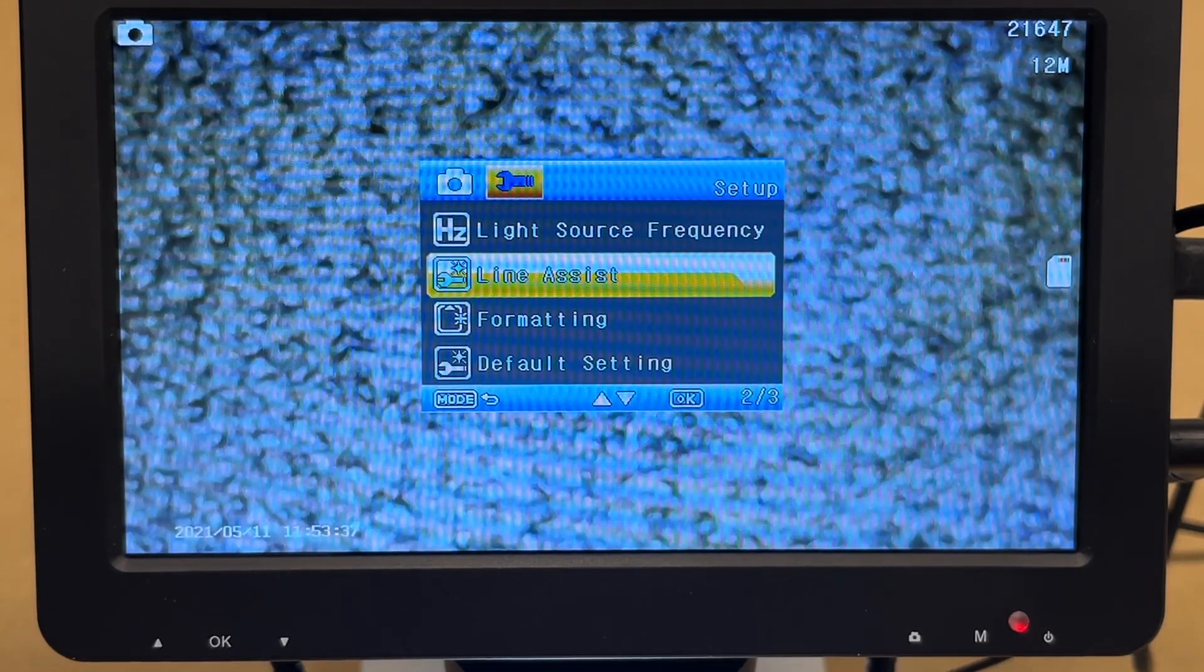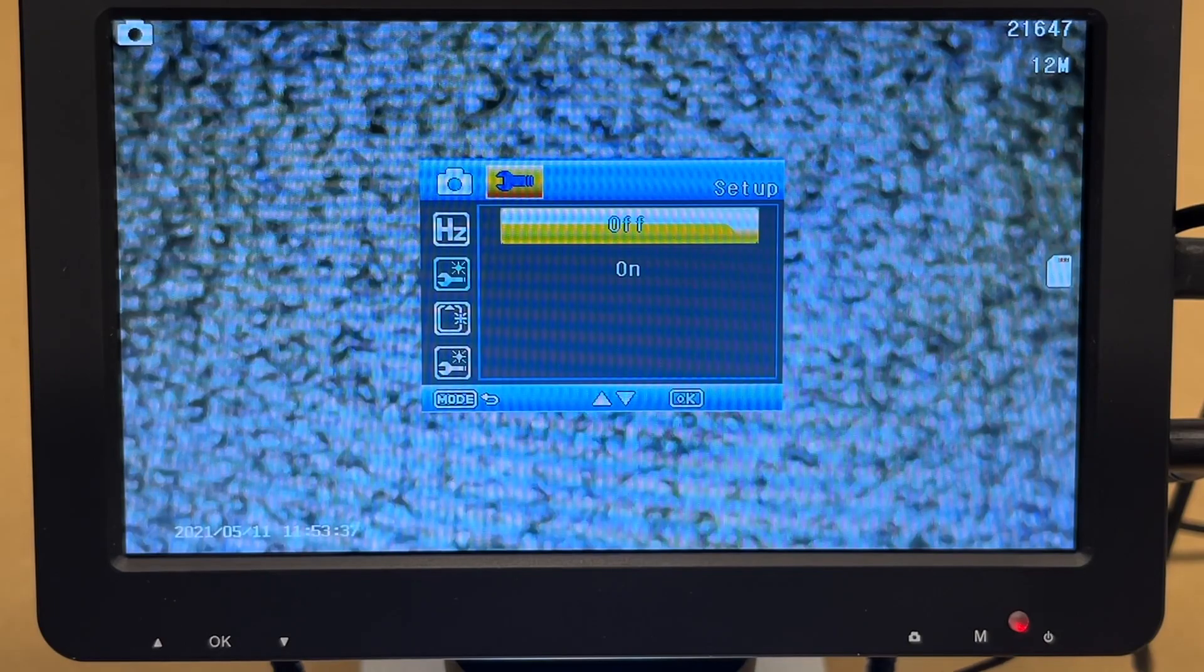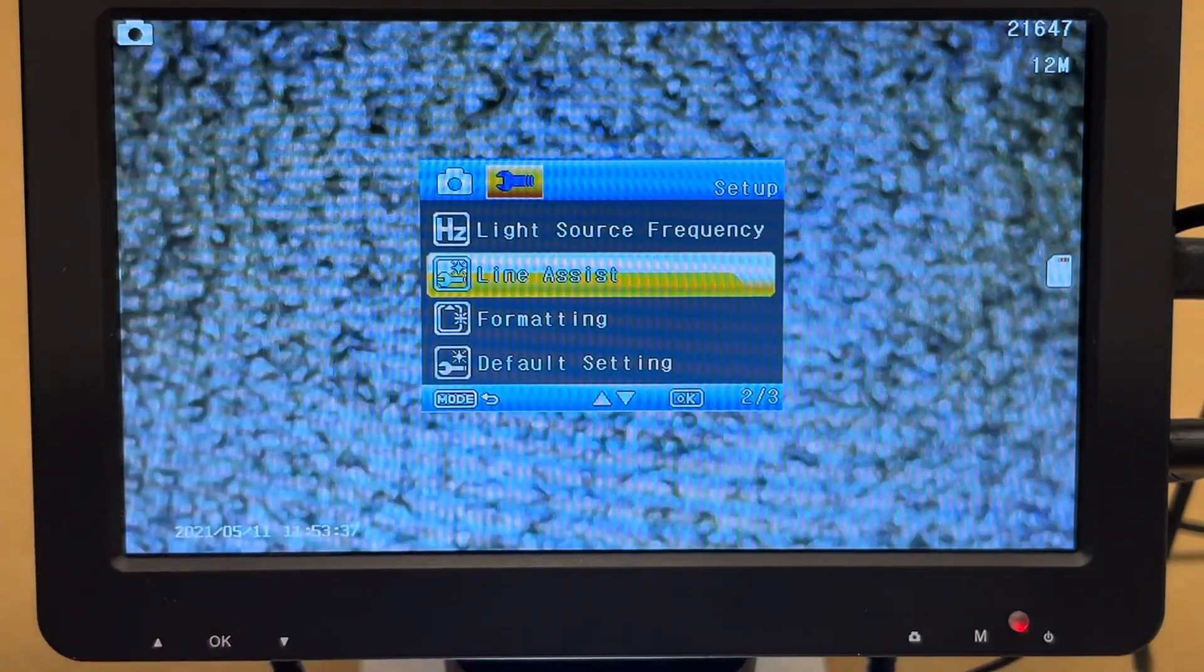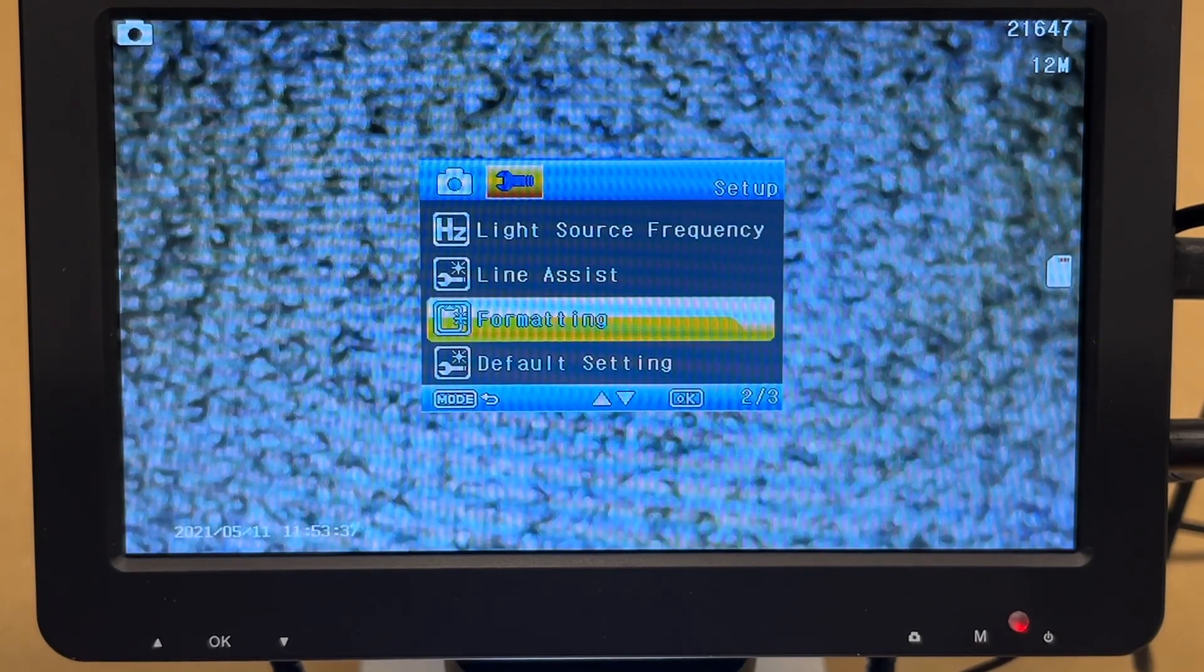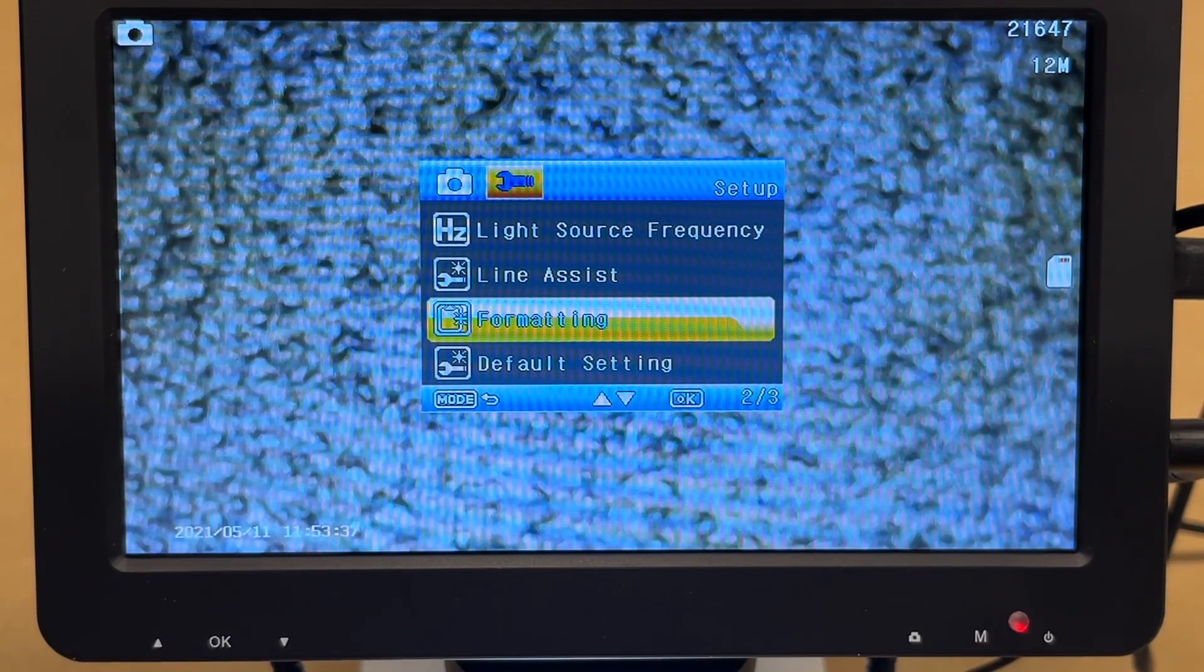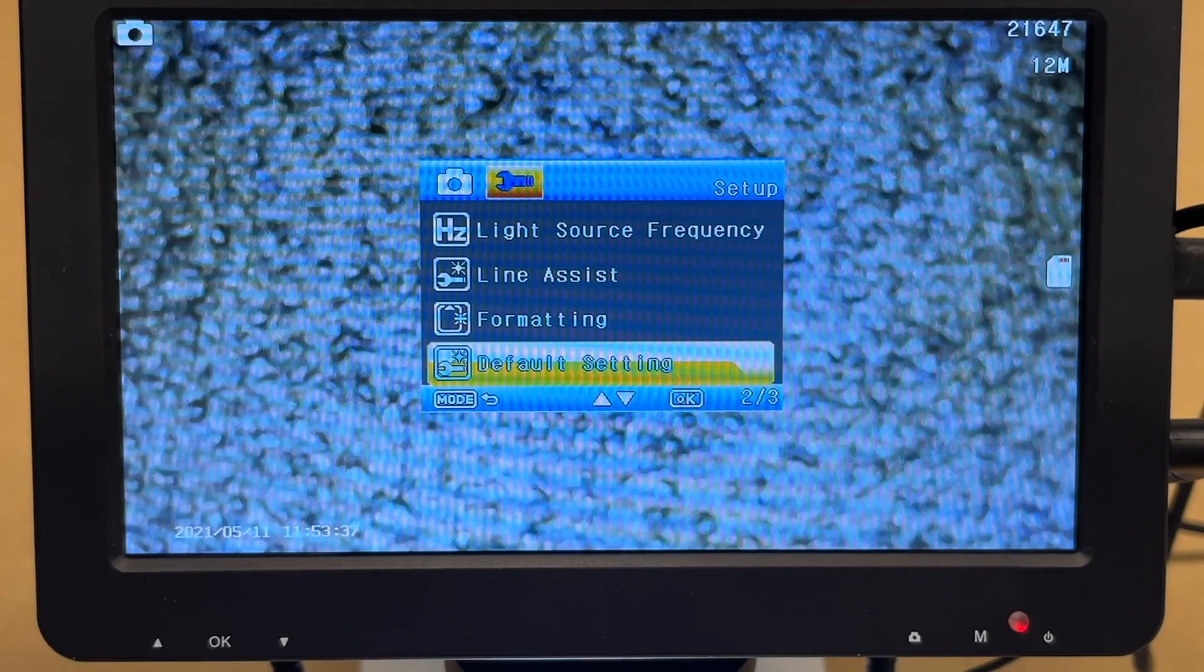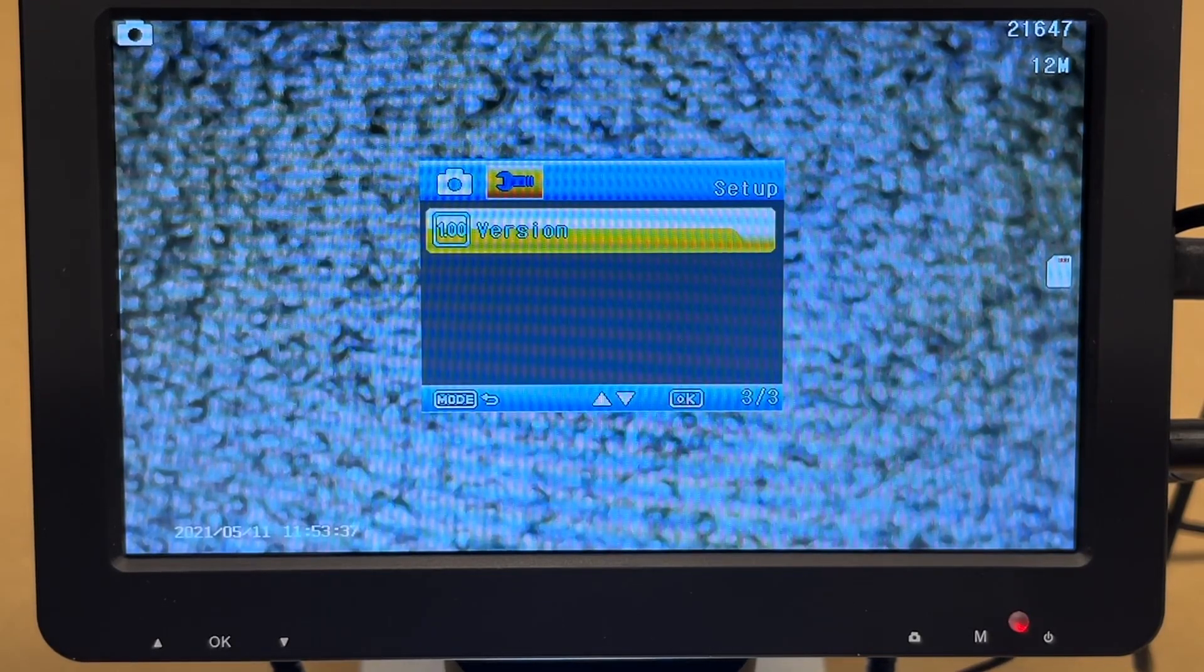Line assist. So this will add some little lines on the screen. You can just turn that on or off. So we'll add a horizontal and vertical line. Formatting. So this will format the card inside. So if you put a new card in, it's not a bad idea to format it. So I have inserted a micro SD card. Default setting. Don't want to do that. That'll reset to defaults. And then we have the version information.